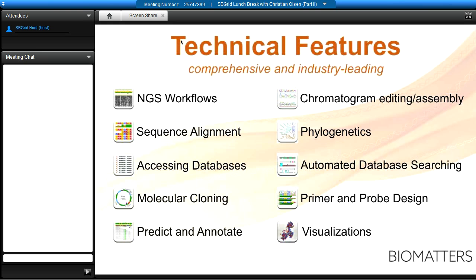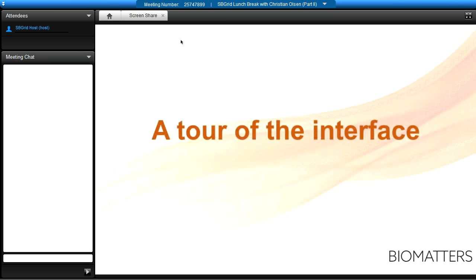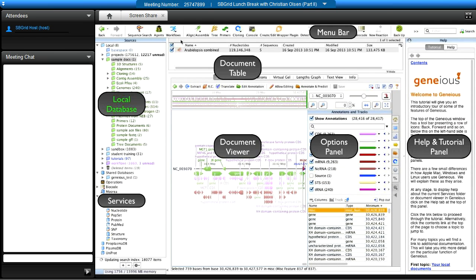I'm specifically focusing on version 7 today. I'll begin with a tour of the interface. When you install Geneious, you see your local database on the left where all your local files are stored — you can rename, color, and organize them the way you or your group works.